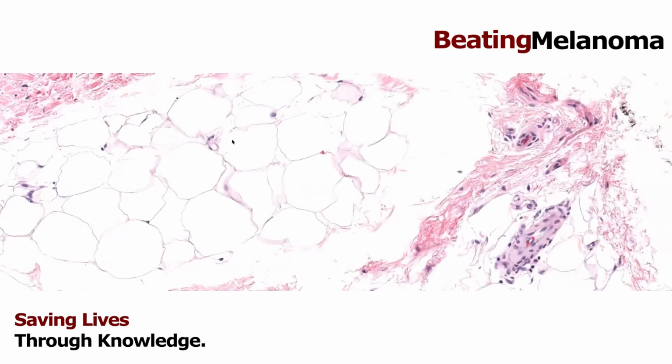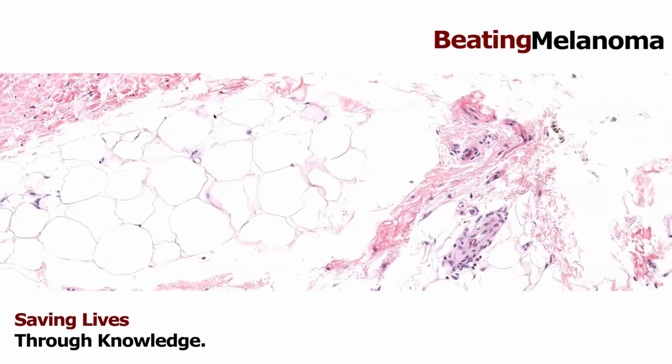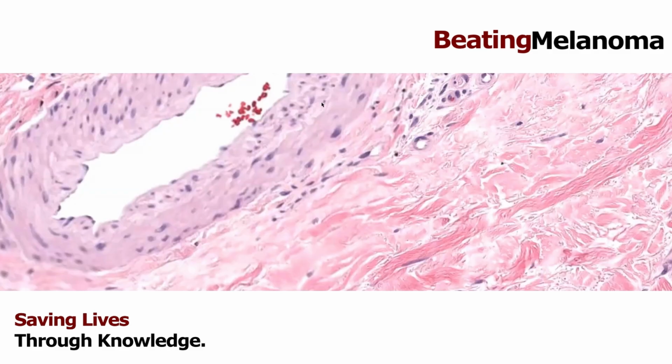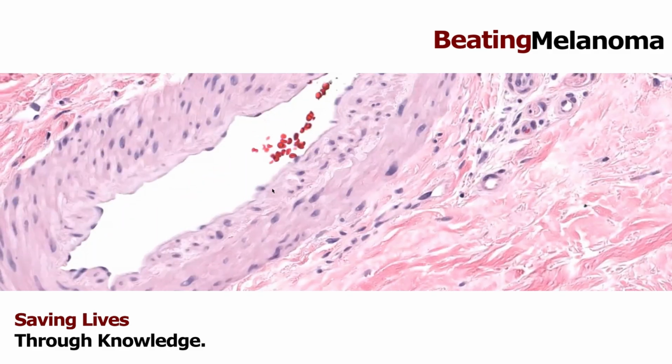So while we're here looking at skin, I thought I'd show those things many people have heard of. There's a bigger blood vessel right here. And look, there's some red blood cells inside. Pretty cool, huh? It's never a boring job.